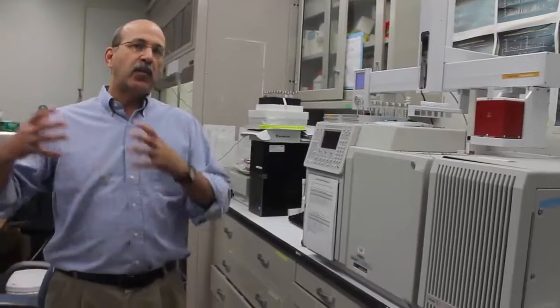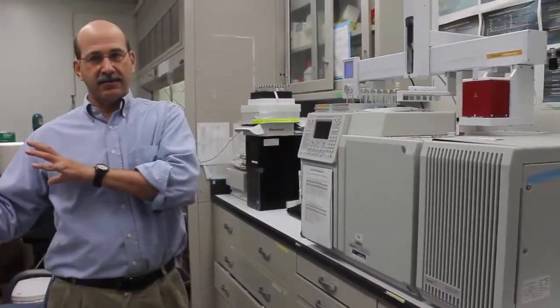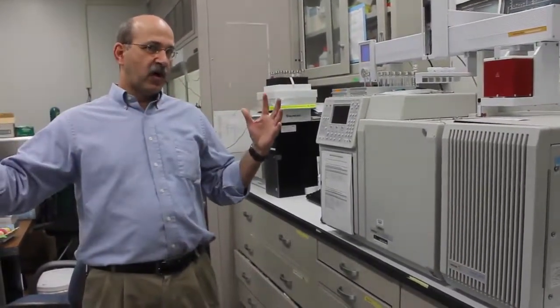And these are ion trap mass spectrometers, which means that we can run multiple mass spectrometric experiments. Or in other words, we can select an ion, we can break it up, we can choose one of the fragments, break that up. We can do that as many times as we want. And the reason we do this is because there are lots of things that may start at the same mass or the same weight.